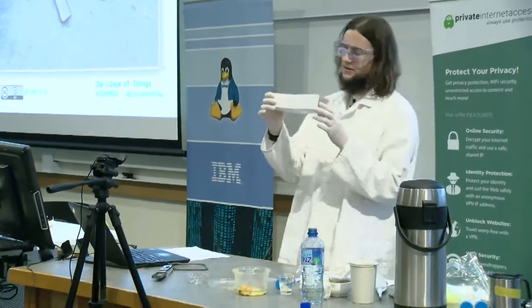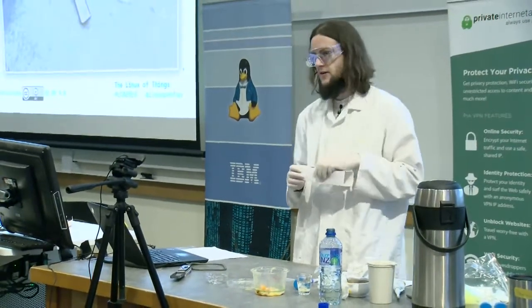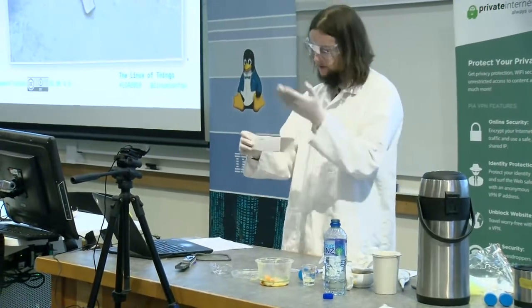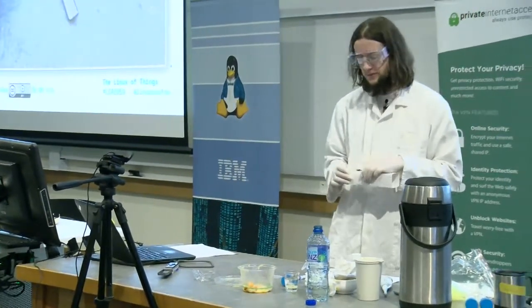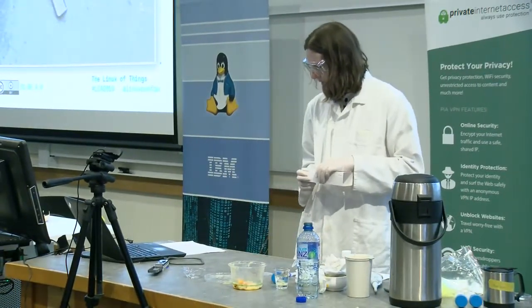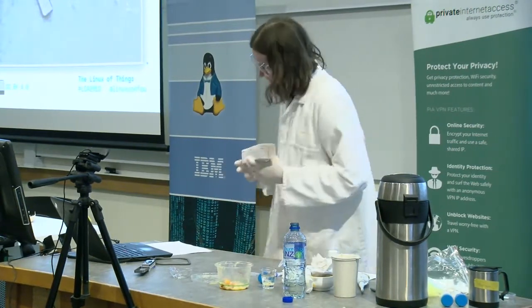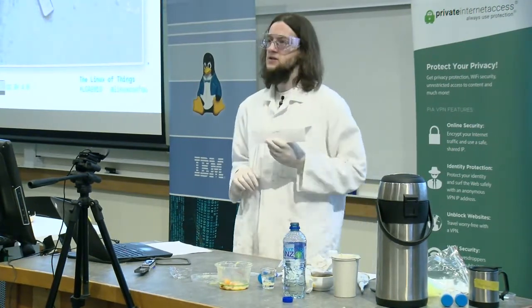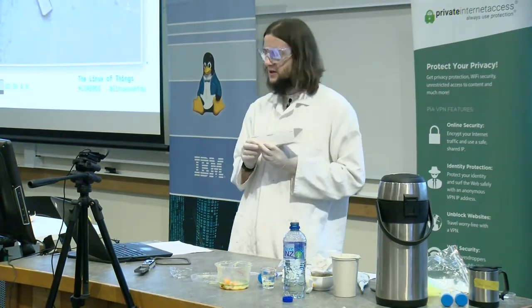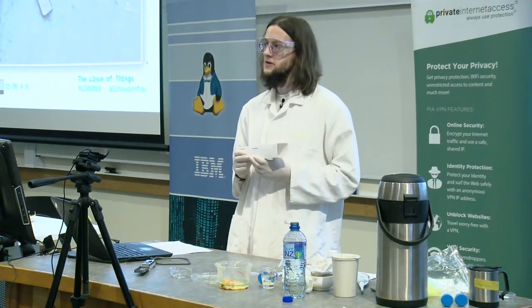This one here is from a company called Oxford Nanopore Technologies. They happen to be the same company that produces this DNA sequencer here. This kit in particular is called a rapid barcoding kit, that allows me to attach a DNA barcode to a sample so that I can run two samples at the same time and tell them apart on the computer side of things.